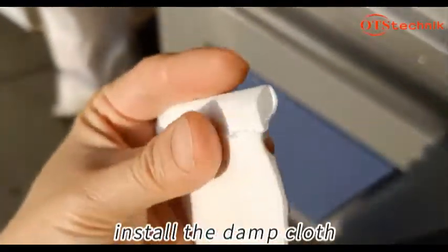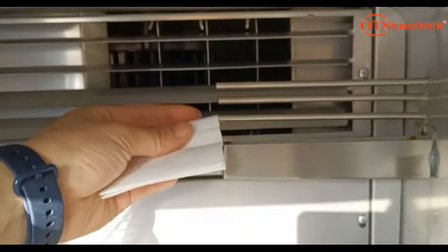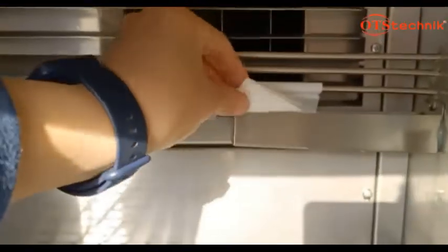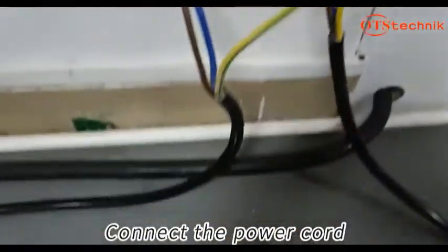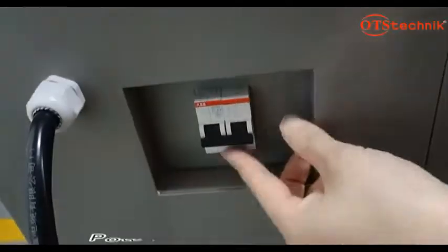Install the damp cloth. Connect the power cord. Power on the machine.